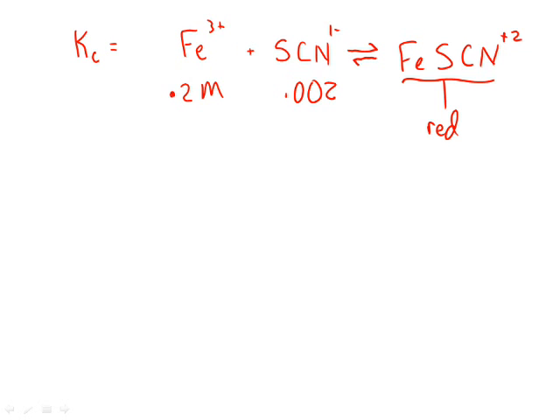Is that right? So notice that the iron is so concentrated that it's going to drive this reaction far to the right. In that series of reactions you did last week, you had 1, 2, 3, 4 different amounts of this that you mixed in.